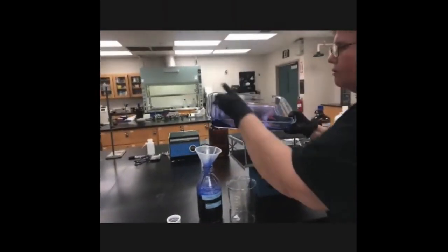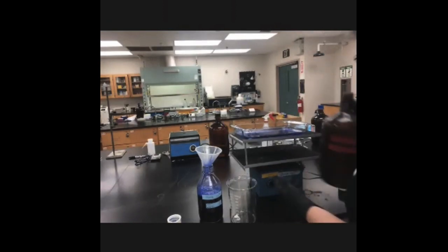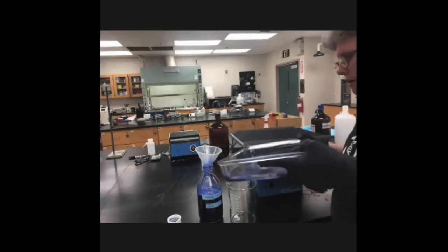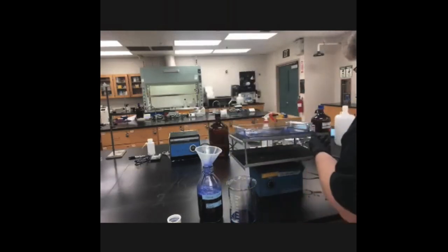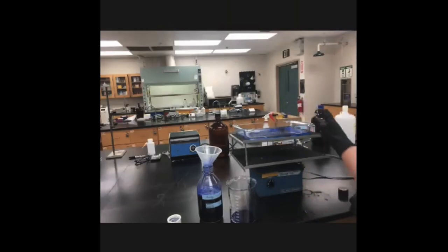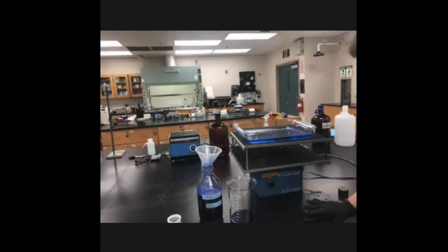So now you can see in our corner right here, we have our gel that is completely stained with Coomassie Blue, and we're going to add some destain to it. First, we're going to add just a little bit of destain to rinse off the high concentration of stain that's in the baking dish. We're pouring that off, and then we're putting the real destain on. A couple hundred mils, it's not important to measure at all. We're now going to let it rock in there for approximately 15 minutes, and then we will keep changing the destain until the gel is clear and we can see our protein bands.